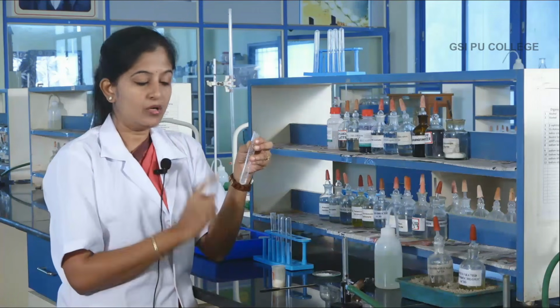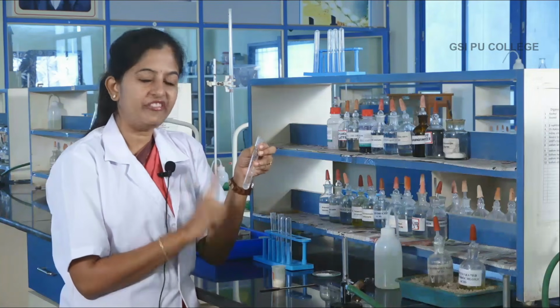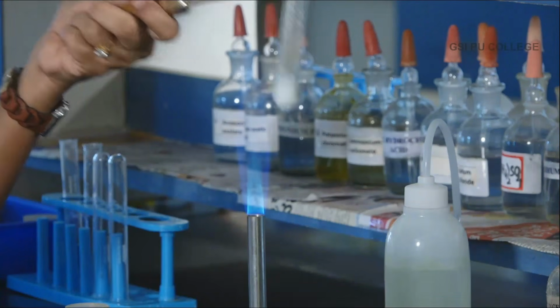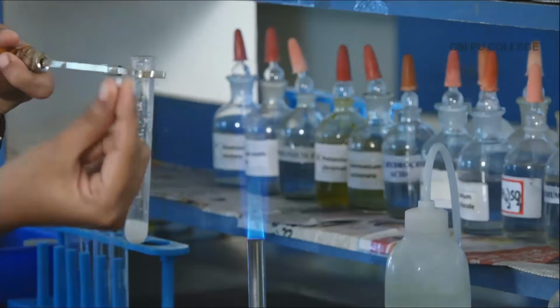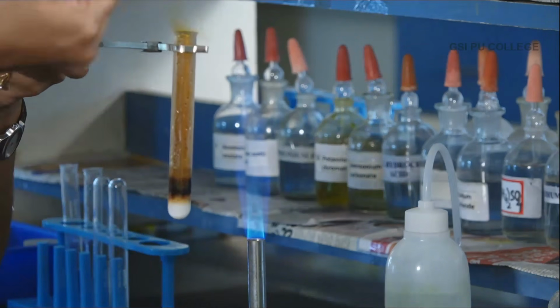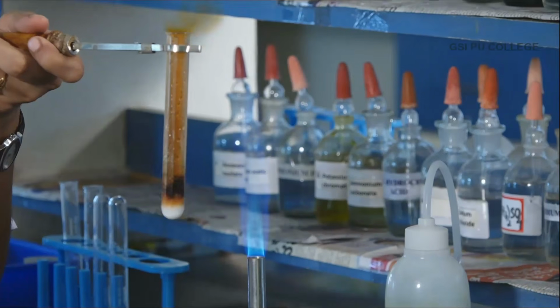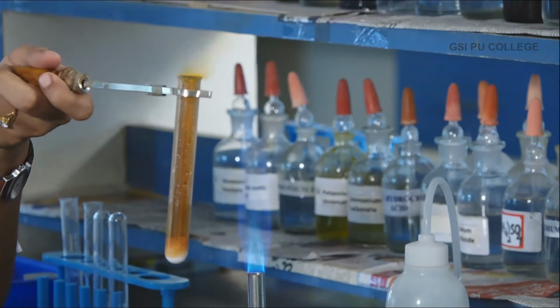Now I have to heat this mixture, salt plus concentrated sulfuric acid. After heating, add a small paper ball. After the solution comes to boil, you can observe it has started boiling. Just add a paper ball. You can observe the brown fumes coming out of the test tube, which means the second group acid radical nitrate is present.